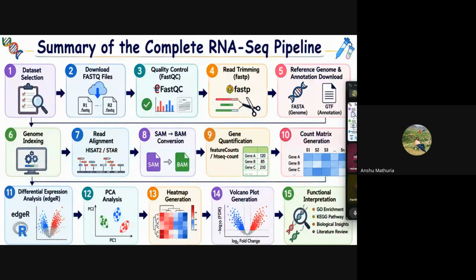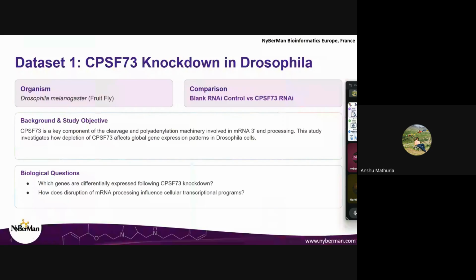So basically, if I have to sum up, RNA-seq is used to understand the expression differences that occur when you are studying two different conditions, either wild type or control, wild type or mutant, wild type treated, wild type untreated, whatever the conditions are. Those are two contrasting conditions that you have, and you are trying to understand the expression level of the genes in both the conditions. If you have this particular goal, then the best thing to do is the RNA-seq pipeline.